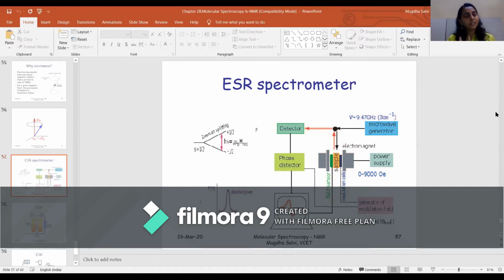Both of them will study a particular sample, actually the chemical condition of a particular sample. But the difference is in having either your NMR or ESR. So NMR will have a radio frequency signal required to resonate the nucleus. In an ESR, you will require a microwave signal to resonate the particular electron.